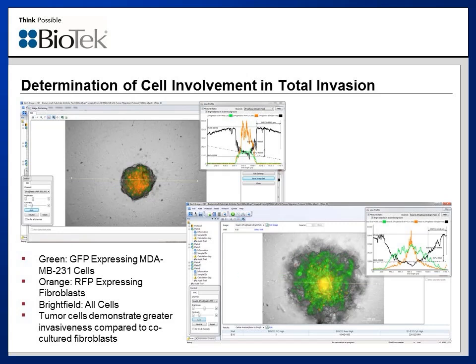And then with the use of the line profile tool, we can draw a line from one side of the image to the other through the tumoroid structure. And the bright field or fluorescent signal captured from each channel within each pixel is then plotted in the graphs that you see here again from the tumoroid on day 0, and then here from the tumoroid on day 5.